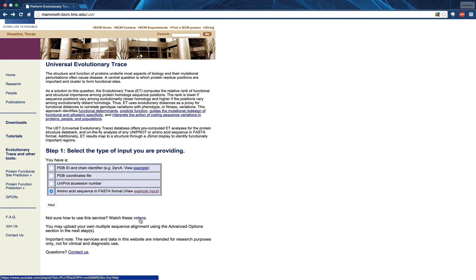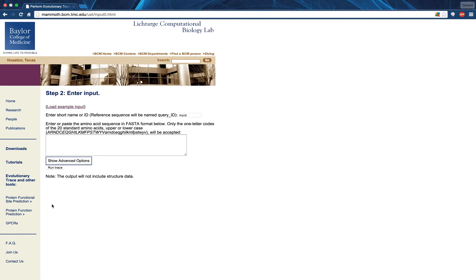Now I will cover the four types of UET input in reverse order. First, the amino acid sequence in FASTA format option. A previous video, linked in the annotation currently on display, will describe this input more fully.